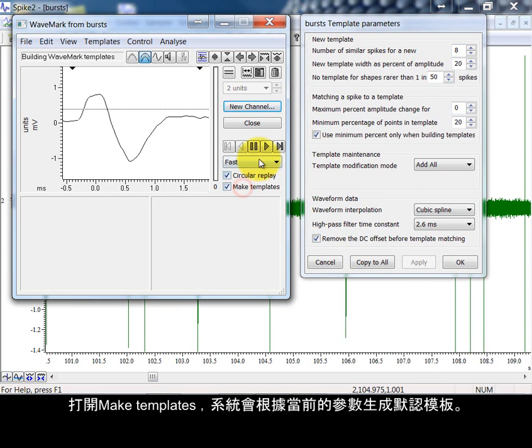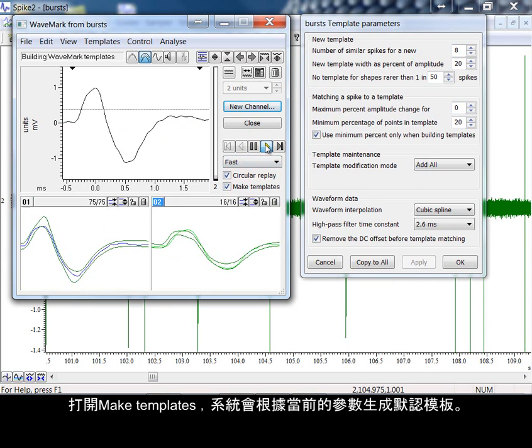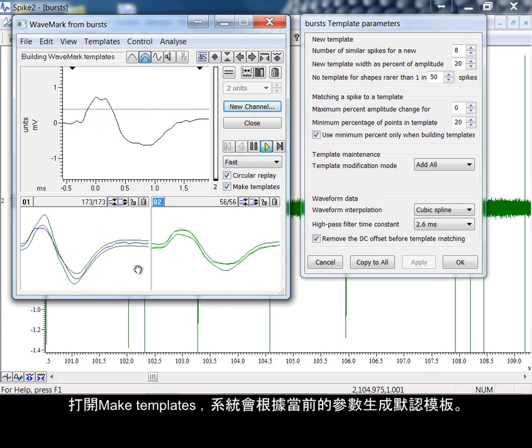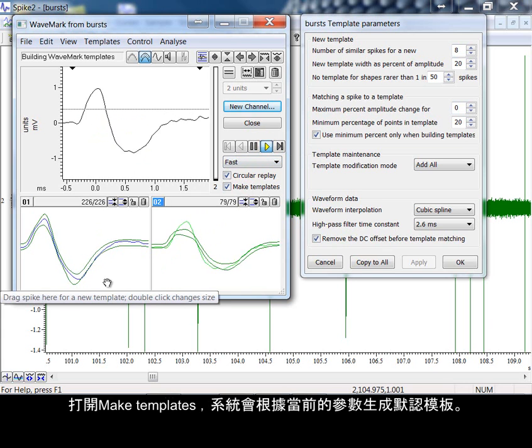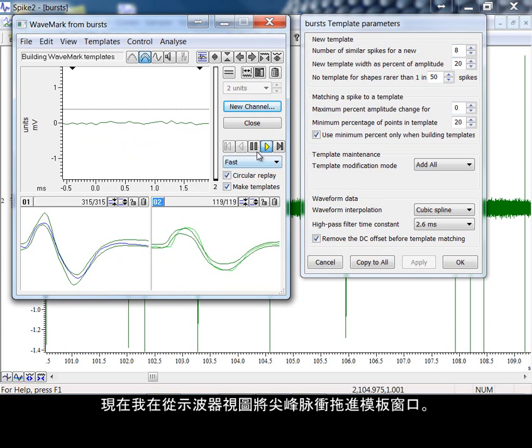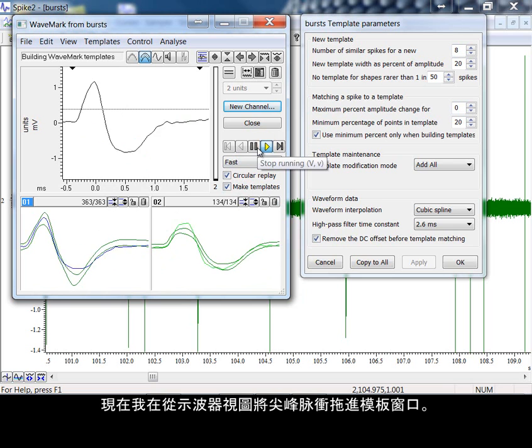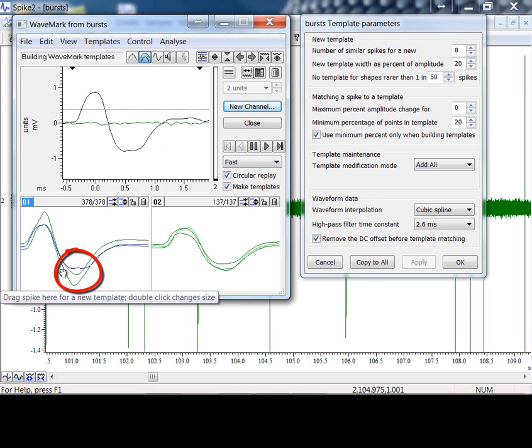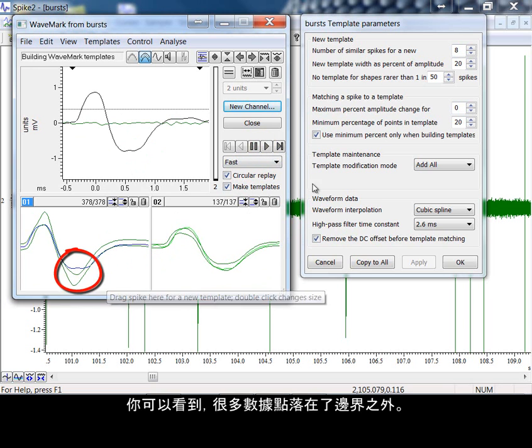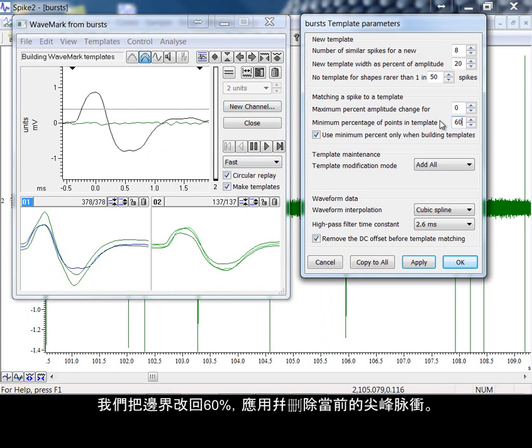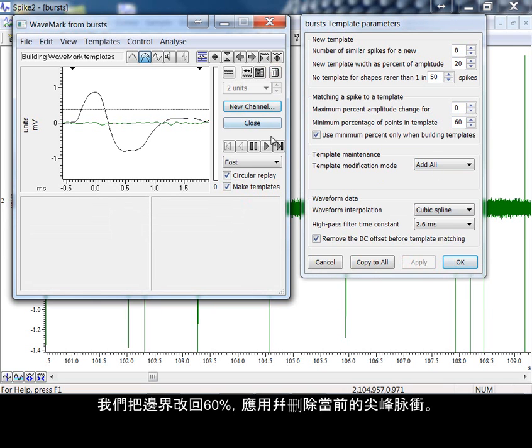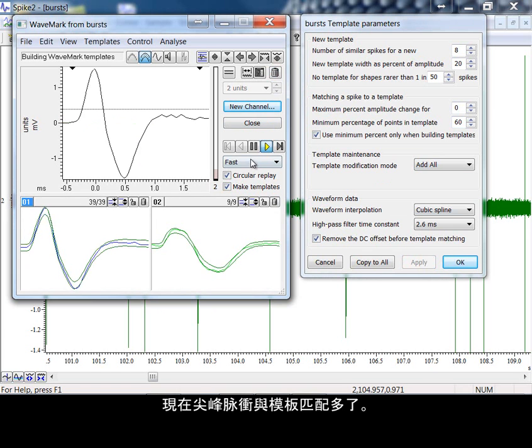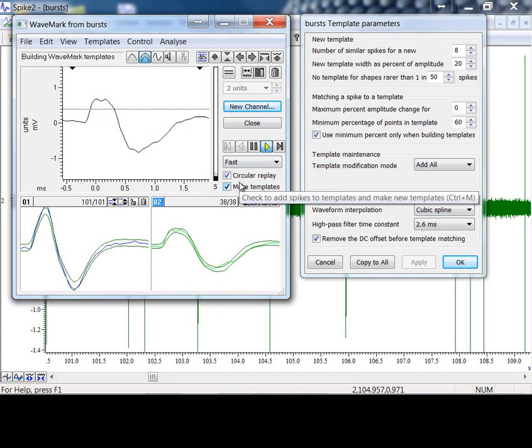With make templates switched on, the system can provide its own templates based on the current parameters. Up until now I have been dragging spikes from the oscilloscope view down to the template window. As you can see here, there are a number of data points that fall outside of the boundary. Let's change back to 60%, apply and delete our current spikes. We should now have a better fit to the templates.